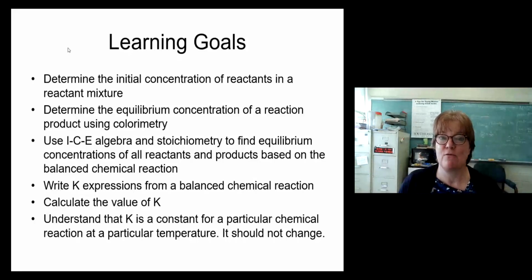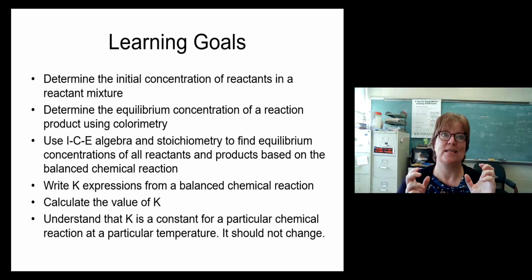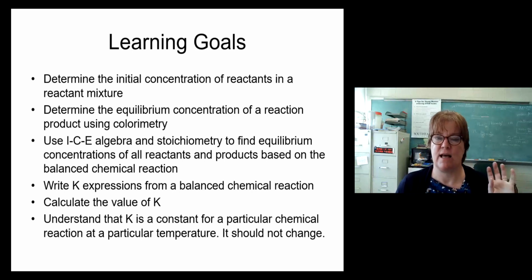Okay, it's time for the equilibrium lab, and the equilibrium lab and the buffers lab, the last two labs, are pretty intense. Actually, buffers isn't intense experimentally, but equilibrium is a tough lab to do experimentally. It is a tough lab to analyze.